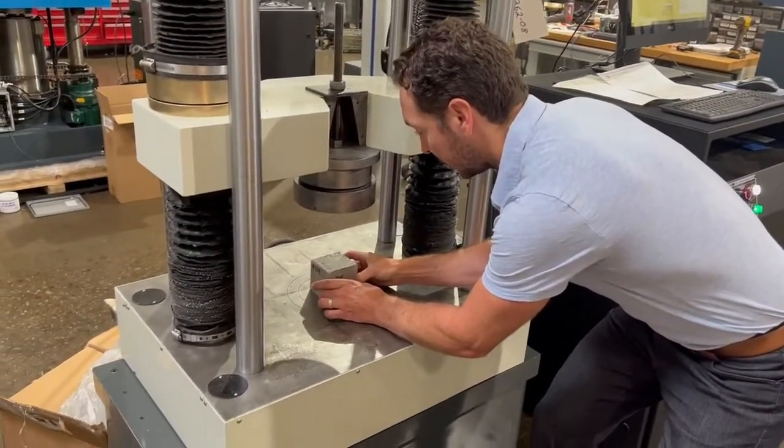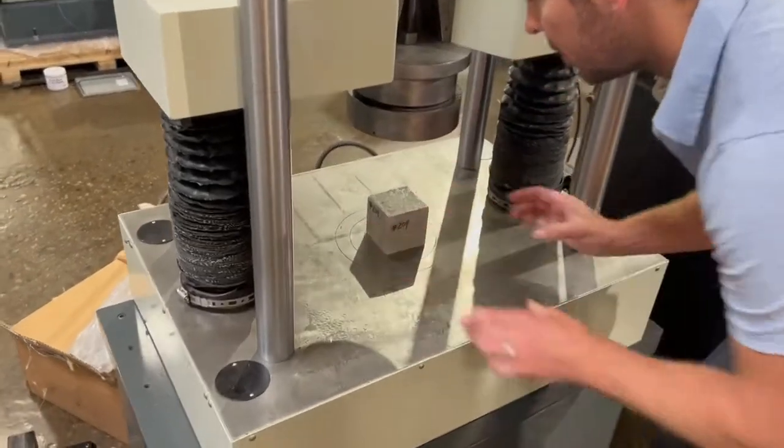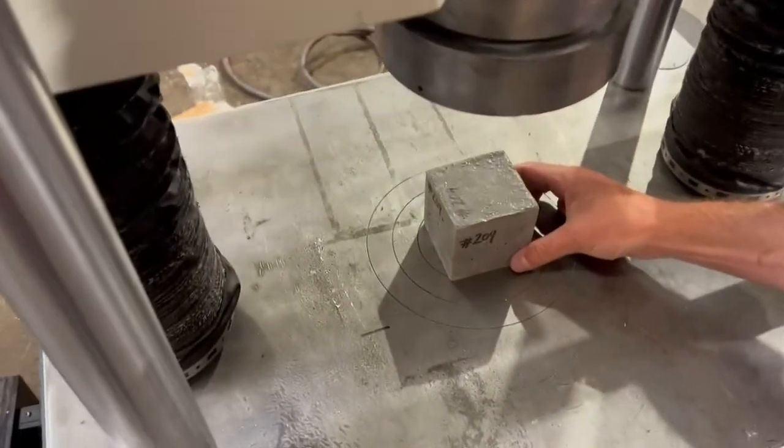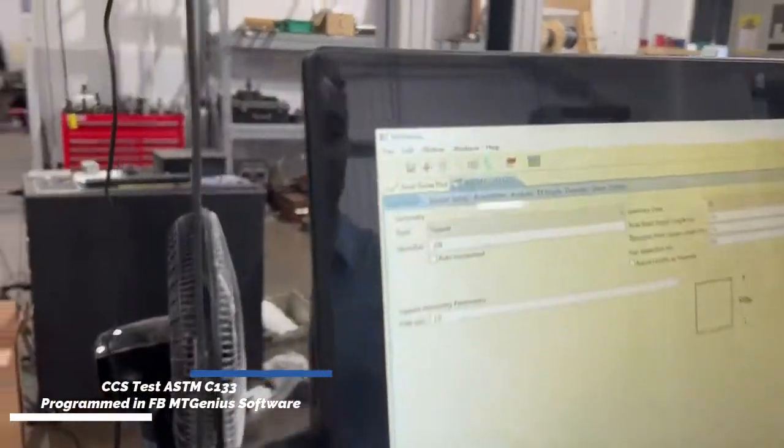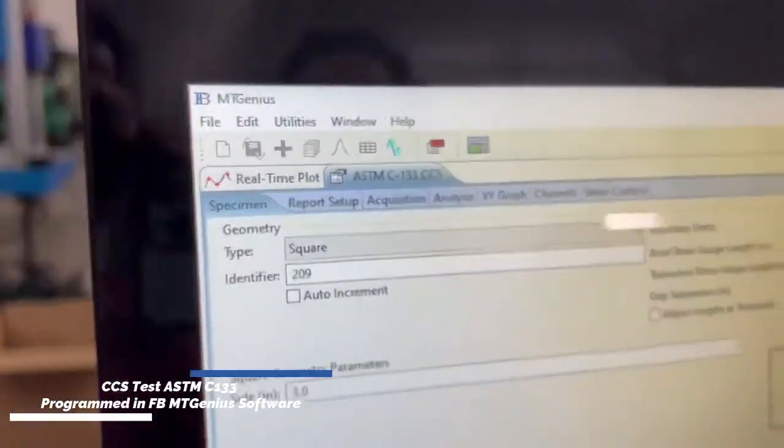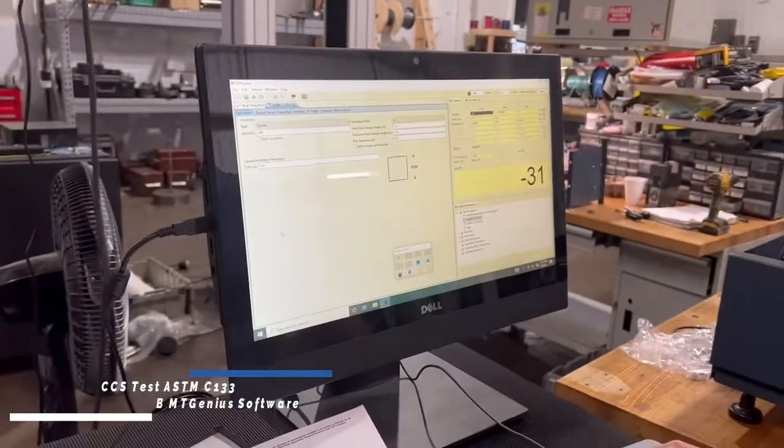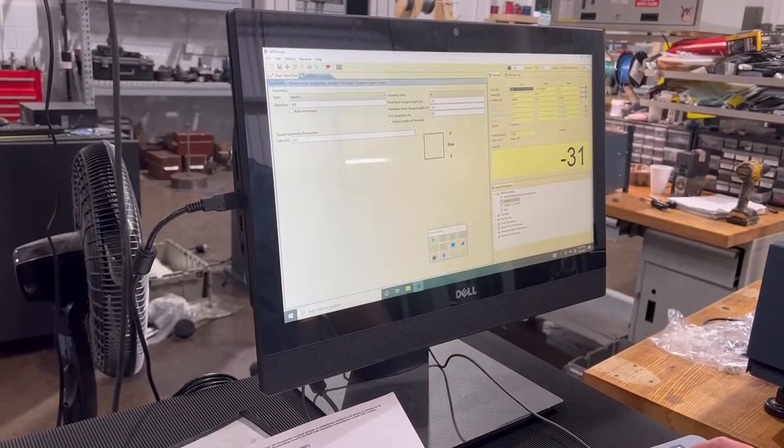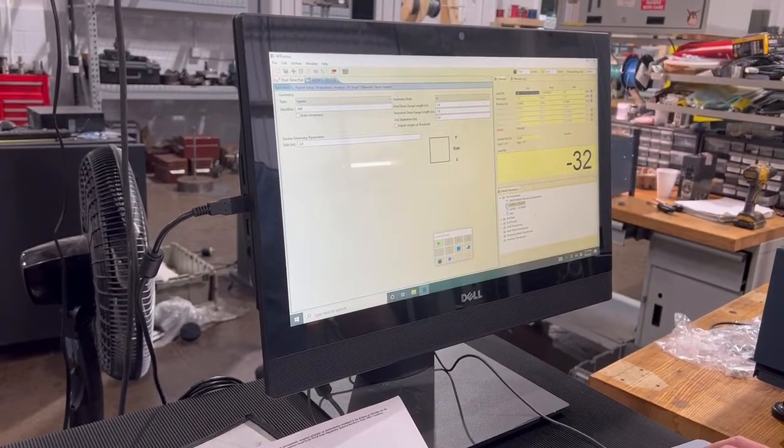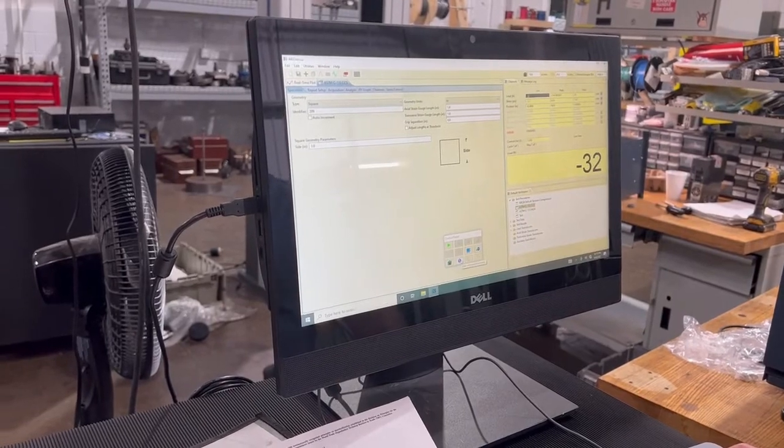Center it on your lower compression circles. We got our CCS pre-programmed ready for testing. We've got a specimen identifier. This is specimen number 209. Like I said, a 3x3x3 cube and we're going to zero this down.